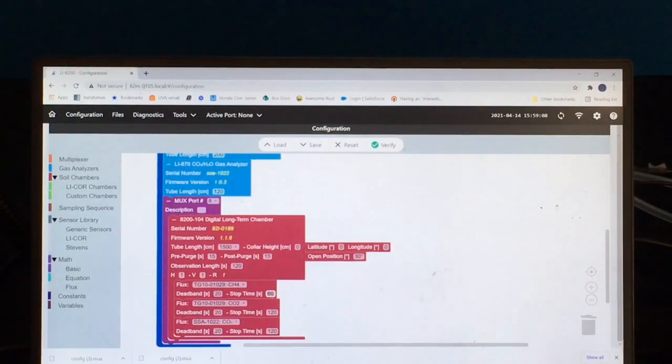Similarly, with trace gases like N2O, which are coming in episodic or pulse events, in those cases you may want to go with a longer period. But when you expect an increased flux rate because of a rain event or something like that, you can always post-process the data in SoilFlux Pro, and you can look at the fluxes for shorter intervals of time also.